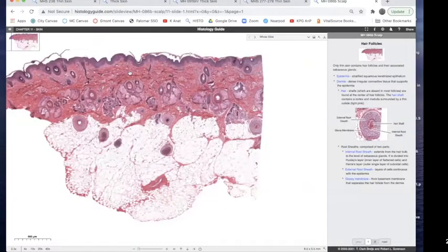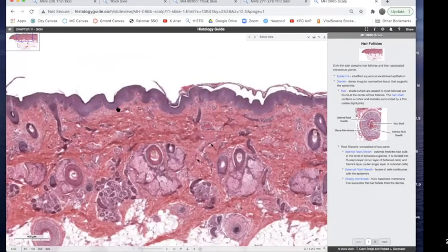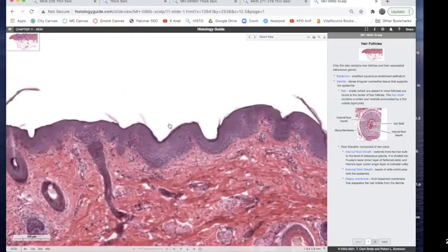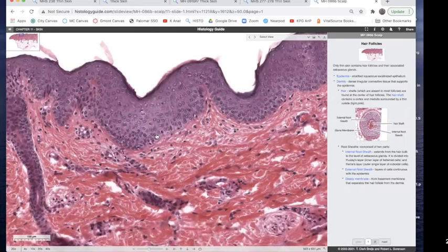And most of it, we covered for epithelial or connective tissue already, right? The only new stuff is that this is called the papillary layer. This is called the reticular layer of the dermis. And then what's the top layer? The stratum corneum. What's the bottom layer? The stratum basale. Lecture-wise, there's just a little bit of stuff on the stuff in between it right here.